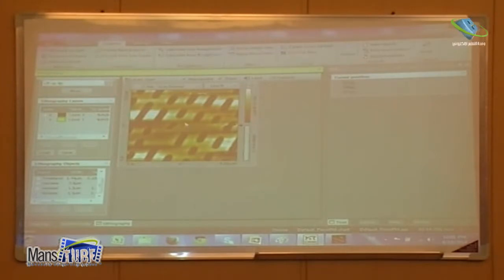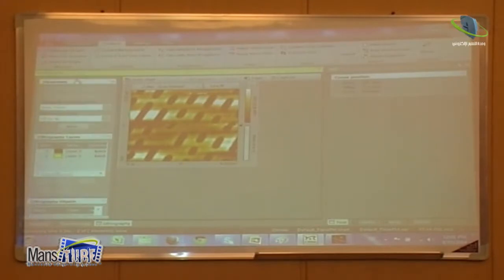You have the line. I'm not sure if I can move it. So, I mean, what I need to know, maybe I need to know the position here, and then I can move it to this area. So, I say if I make, so the position here is 3.3 micron, and the Y position is 105 nanometer. Okay? And then I will go to, I will make a, wait a minute.